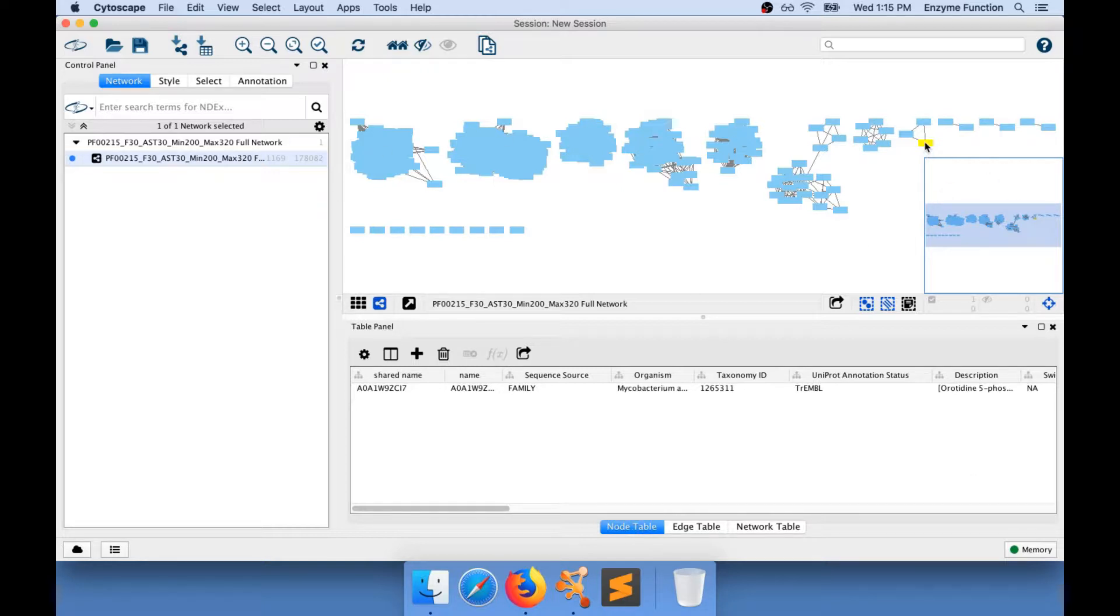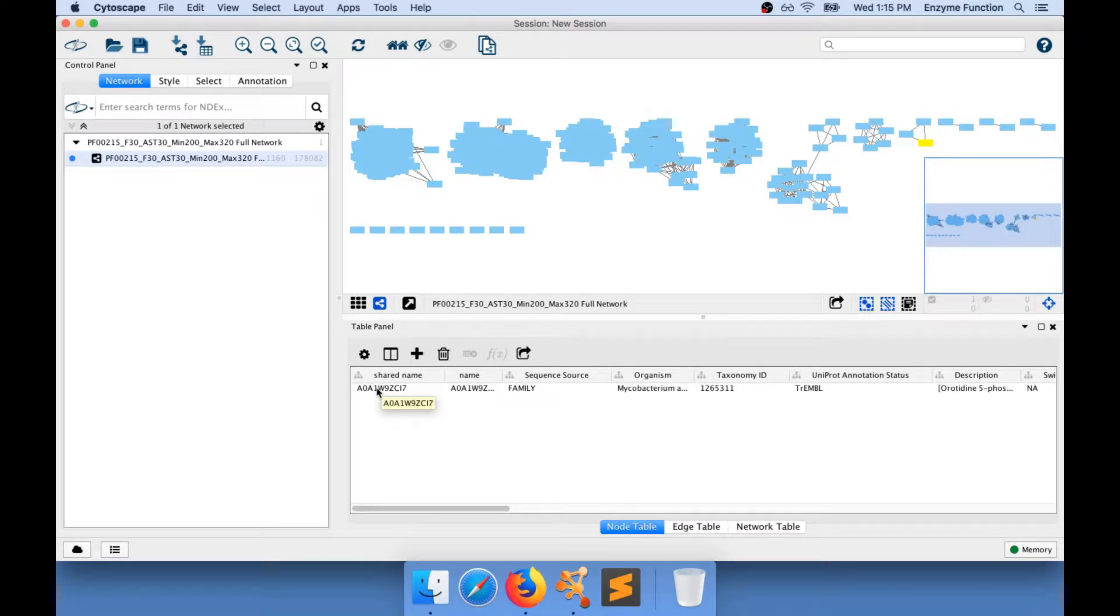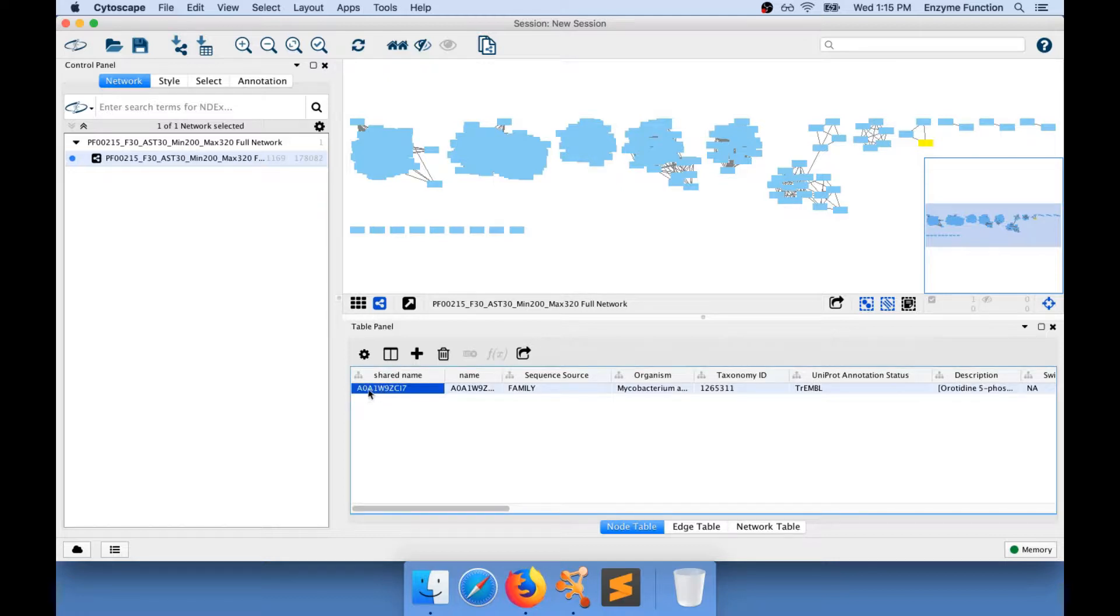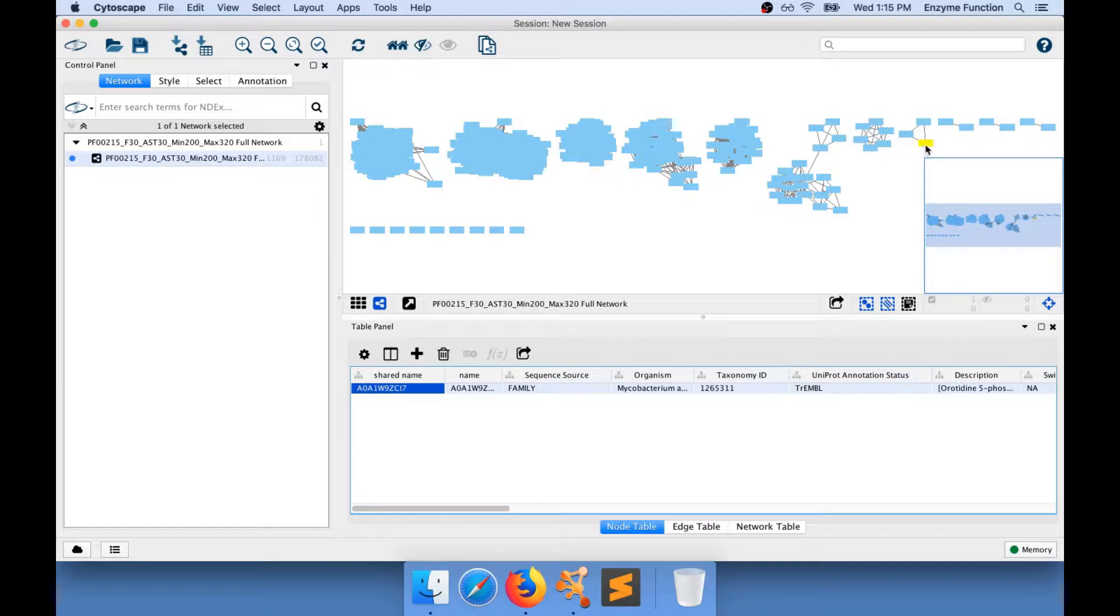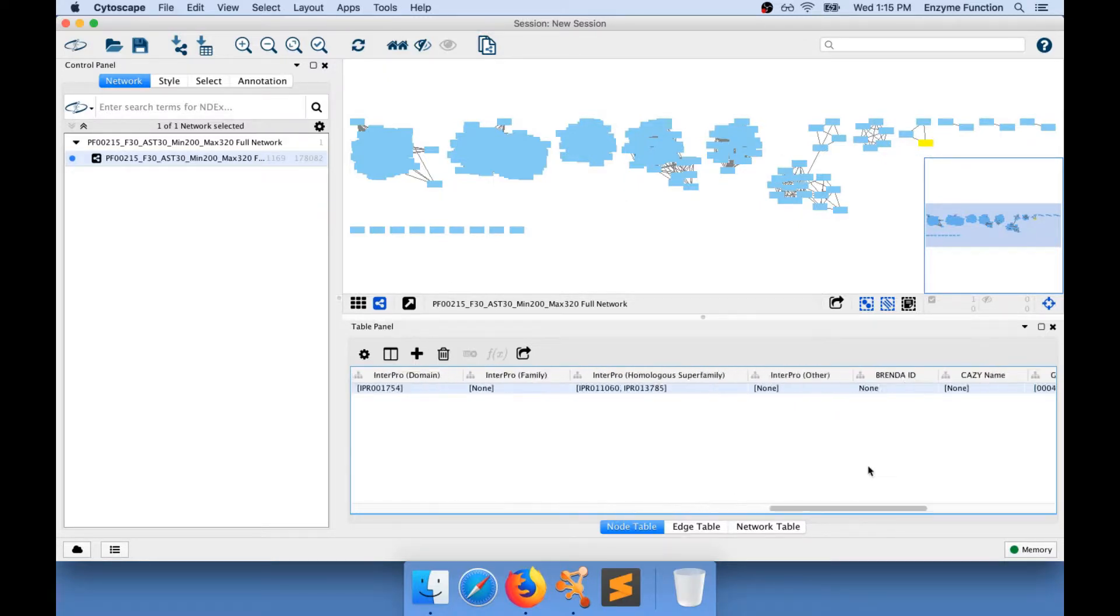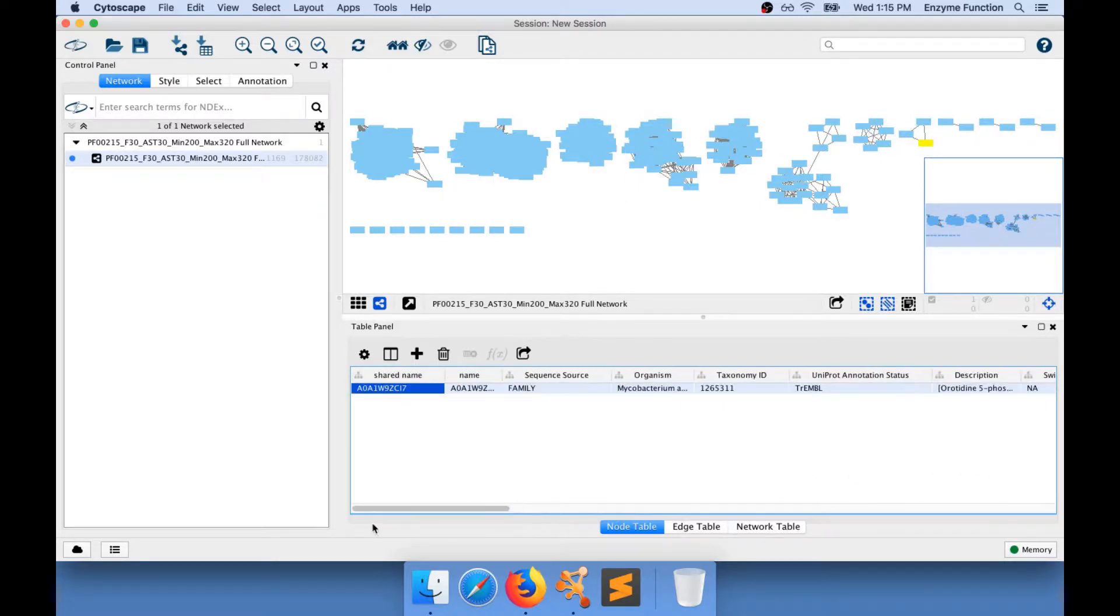When I select a node by clicking on it, I will show the node attributes information for the selected node only. I have here the UniProt ID of the sequence that is represented in this node, and I can see a lot of information as node attributes.